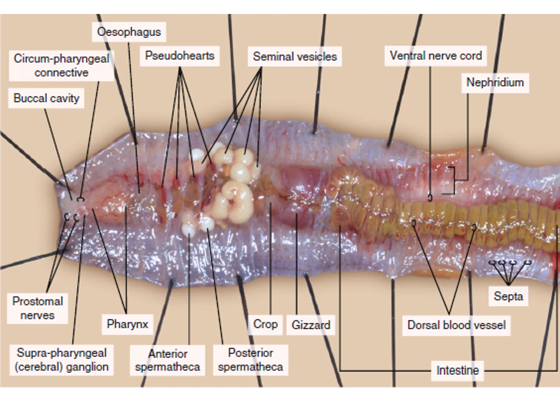This individual produces sperms, and they are stored in these seminal vesicles. So we have to tweeze them with the tweezer and remove them, and under that we could see the parts of the digestive system.